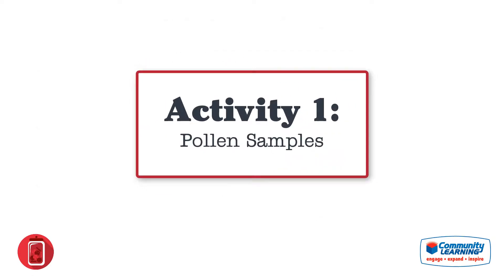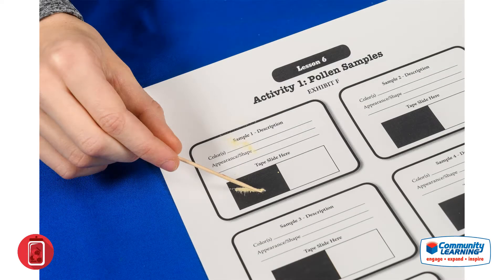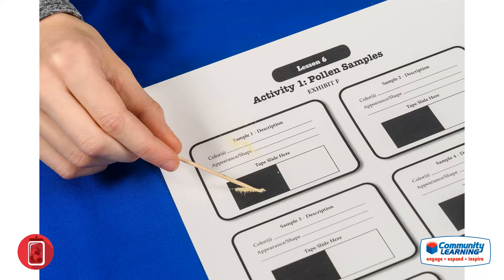Activity One: Pollen Samples. This lesson includes five different pollen samples. It is important not to mix the samples, as mixing will nullify your results. The students will use a toothpick to pick up a small sample of pollen and transfer the sample to the pollen sample sheet. They need to place some pollen on both the black and white areas.